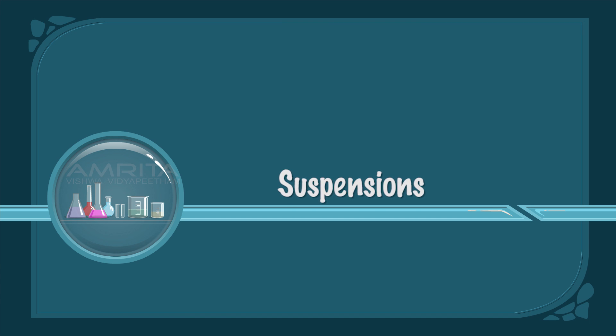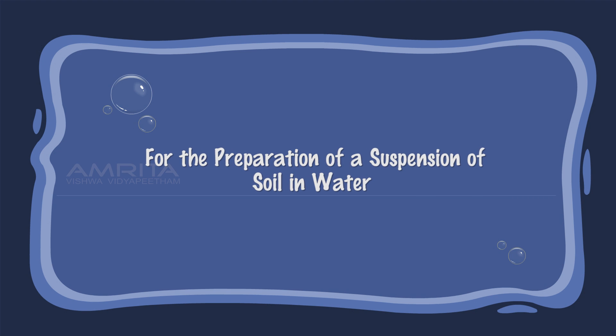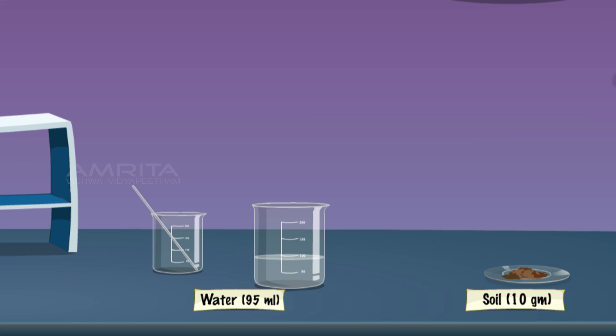Suspensions. For the preparation of a suspension of soil in water, add 10g of fine soil in a 250ml beaker containing 95ml distilled water. Then stir using a glass rod.